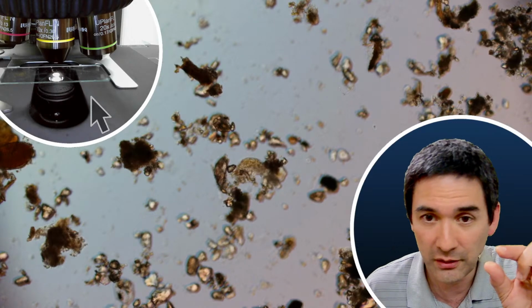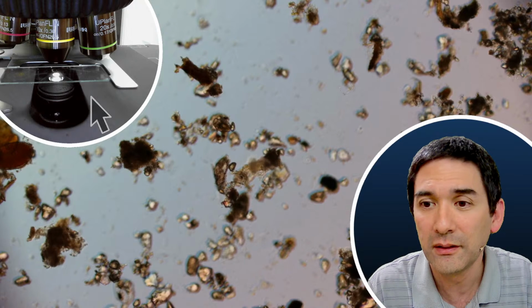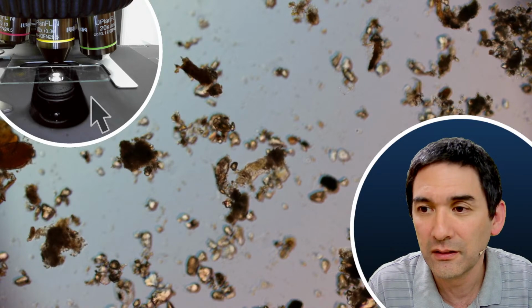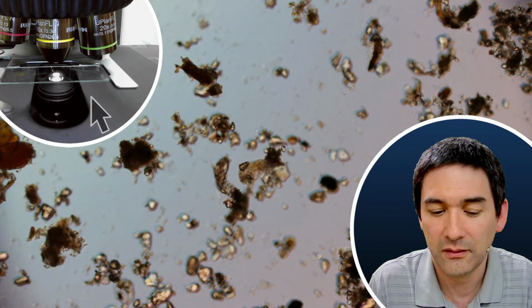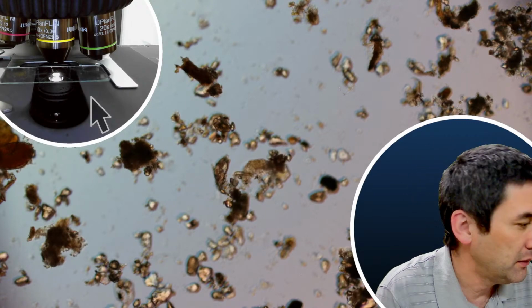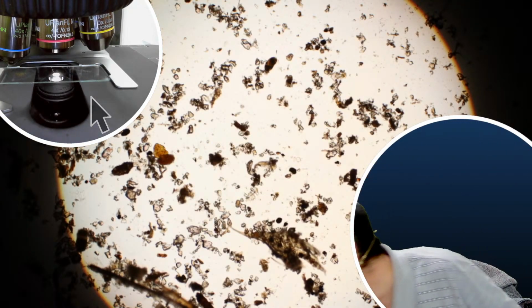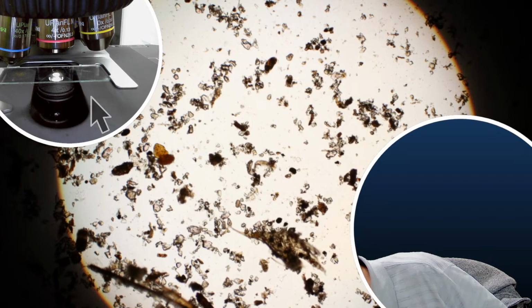So I've got over here a cover glass, and I'm just going to dry wipe it a little bit. Okay. I'm going to simply try to drop it somehow directly on the, look what I got here.